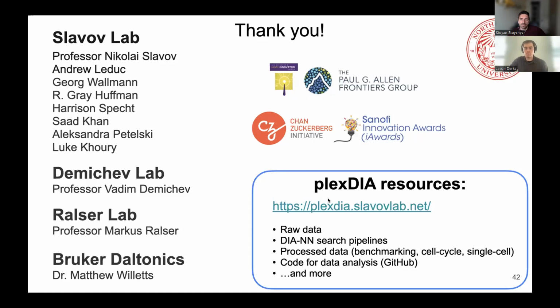Right. So we ran it with 2 different data acquisition schemes. And I will say that the duty cycle that we ran on the bulk level was quite long. So for that, DIA-NN actually does a really good job of identifying spectra, even if you have very few scans. And sort of miraculously, it does this. So for that, we kind of optimized the coverage by having fewer data points per peak, just for the bulk.